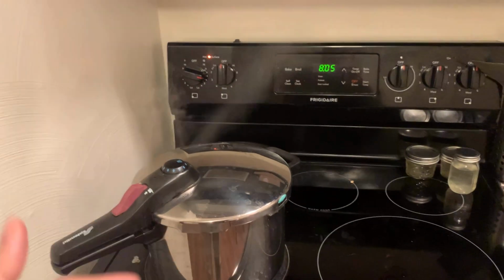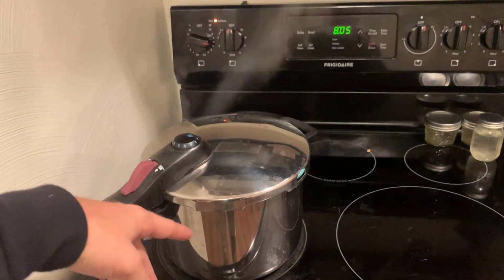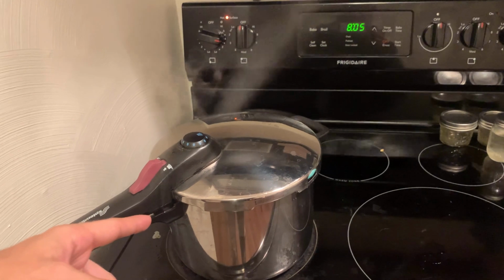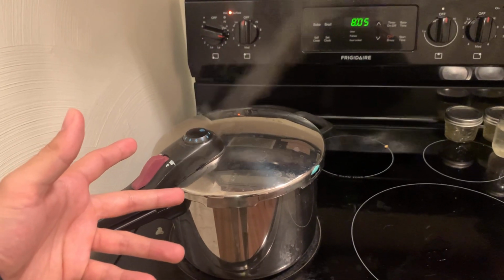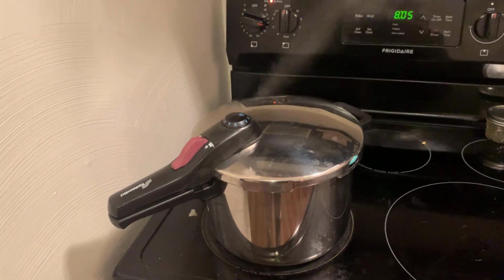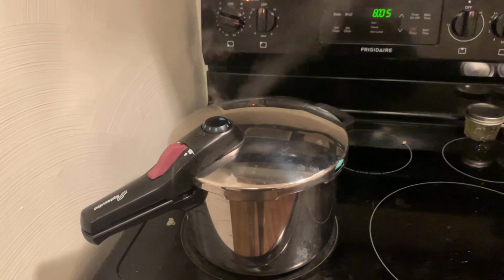So this is what you're aiming for with your pressure cooker. This is letting you know that, hey, it's up to pressure. You're gonna want this at 15 PSI for 90 minutes. It's gonna be kind of annoying to listen to this for an hour and a half, but you kind of got to get used to it. So we'll come back in 90 minutes and I'll show you guys what the next step is.